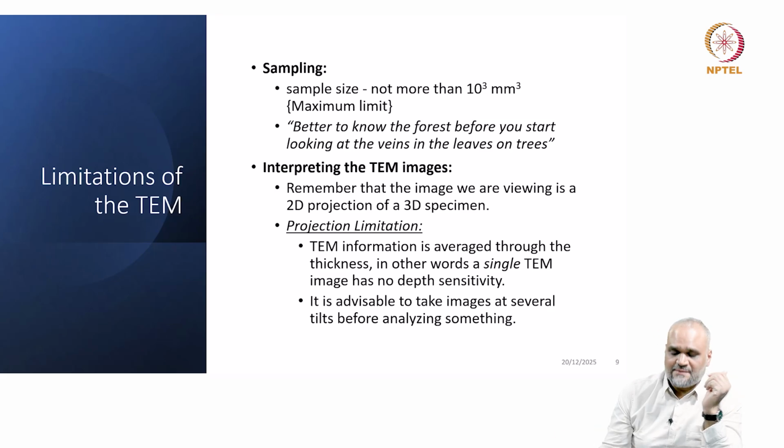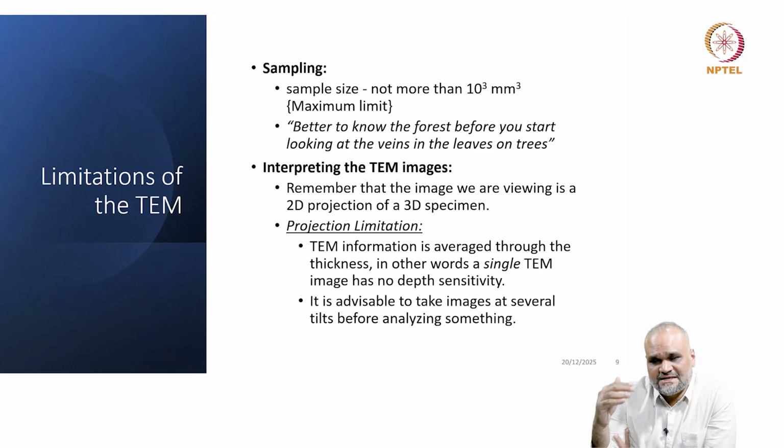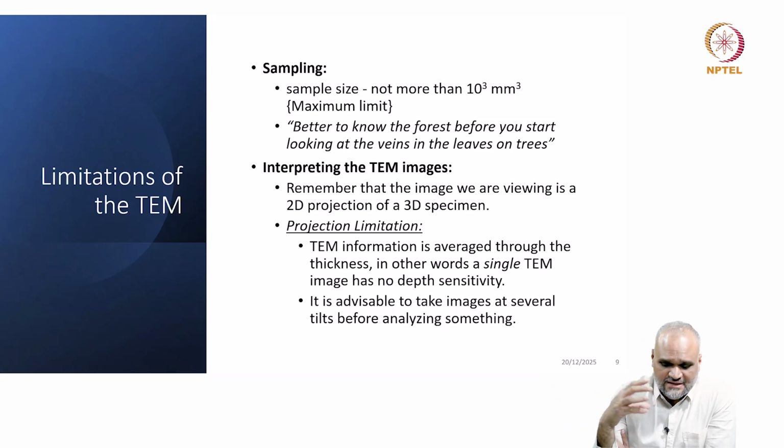So when I get three-dimensional information from a sample in a microscope, in a TEM in particular, I should get a series of projected images, and I have to do a mathematical reconstruction to get three-dimensional information.